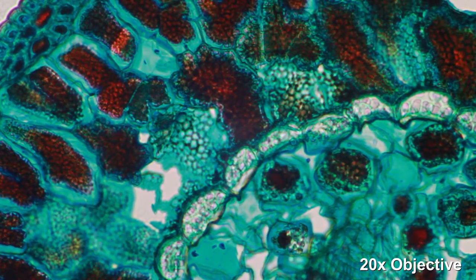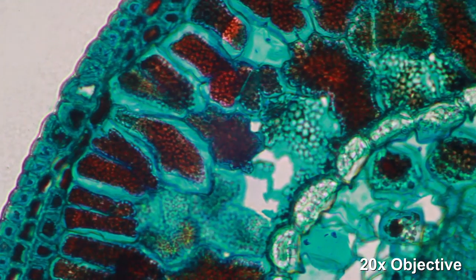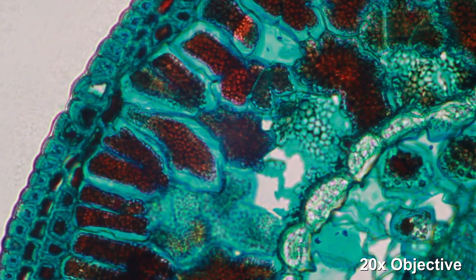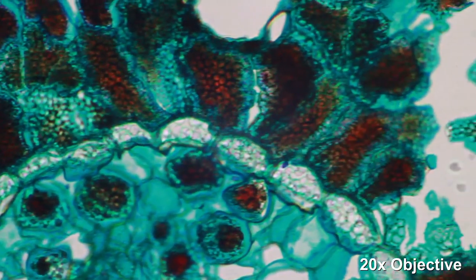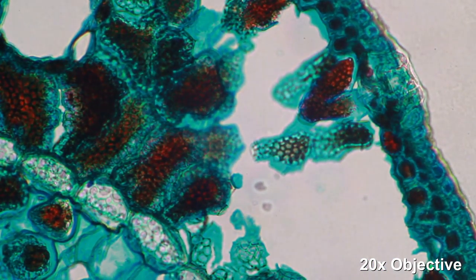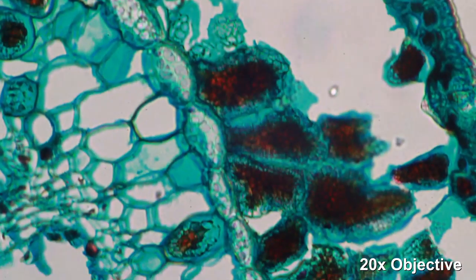Again, here the endodermis is quite well visible. You can see that the company that made them used various stains, and for this reason the different parts of the pine leaf have different colors.